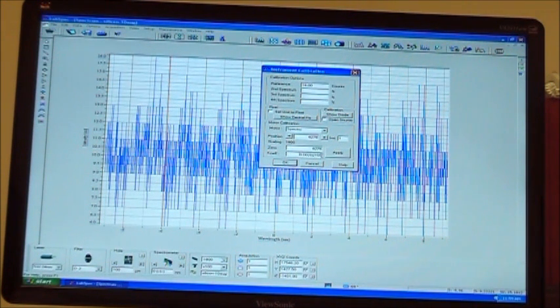Always, before altering the 0 or the coef, write down the numbers on a piece of paper, because it's very easy to be doing something, you move, and then you hit backspace on the keyboard, and the whole coefficient is gone, and then you have no clue what it was. So I always recommend for the systems that you keep a logbook where you write down what the last coefficients were, just in case they ever get deleted.